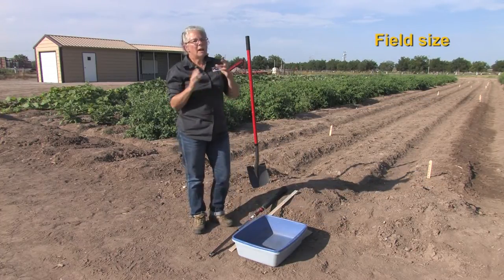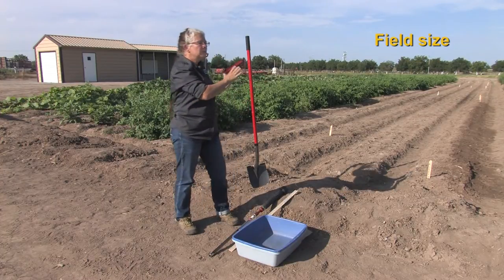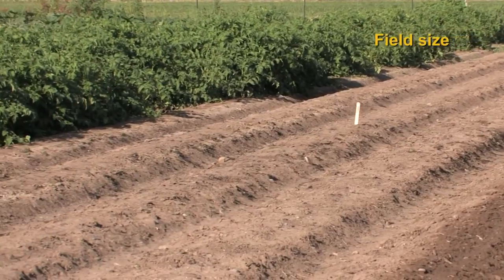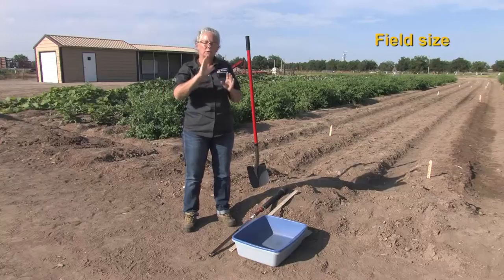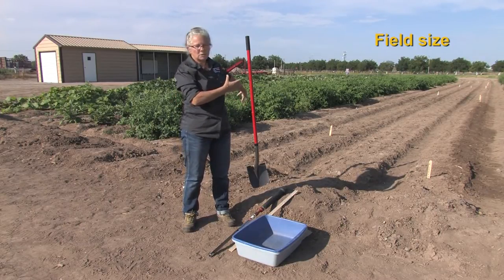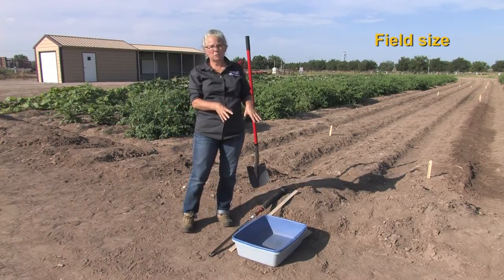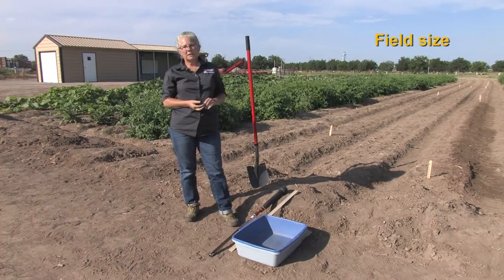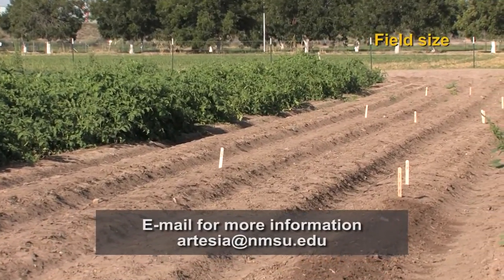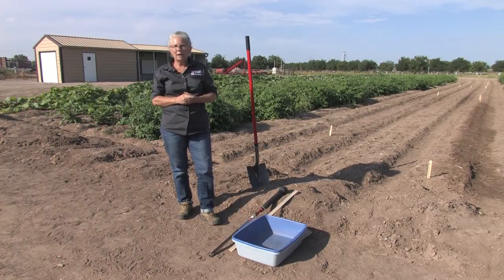Field size is important in determining how many cores, probes, or shovelfuls you will take. It's also important to remember that you want to take a composite sample across the whole field — just going to one place will not show you what's available across the entire field. So when demonstrating the actual sampling we will be going across different locations on this field. In a smaller field you might want to take at least a cup, though two cups of soil sample is better. The bigger the field, the more samples you need to take to represent the field size and the variability in nutrients across it.